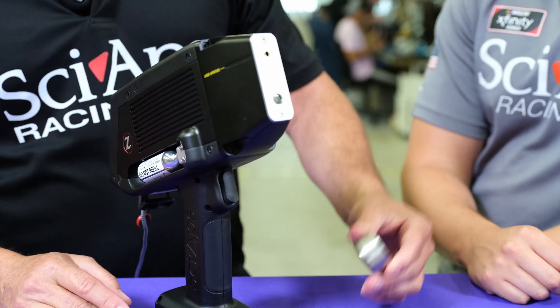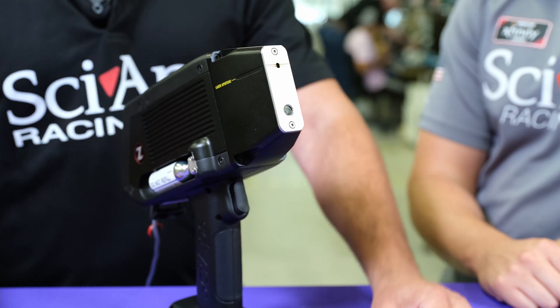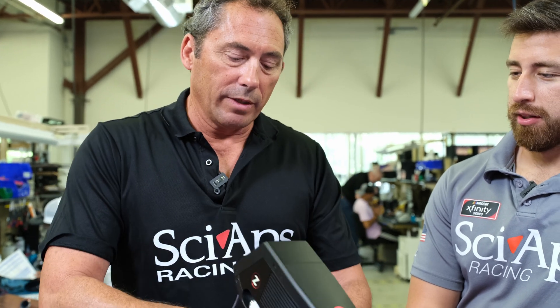Especially because you guys are out — it's hot, you know, especially in a refinery or a pipeline. The last thing you want to be doing is shooting it again and again wondering, because look at that. This is a 304L.